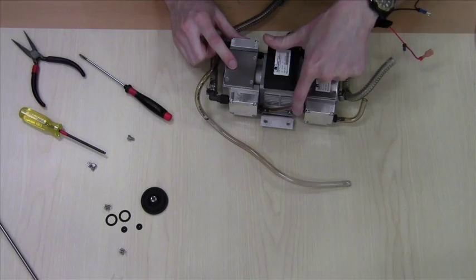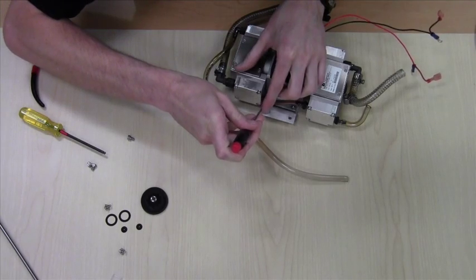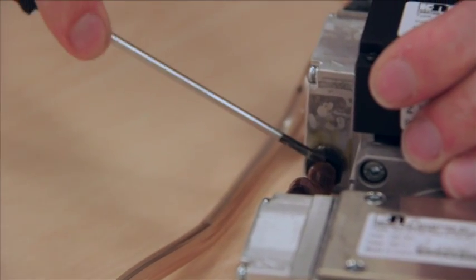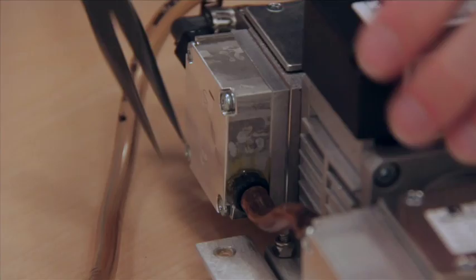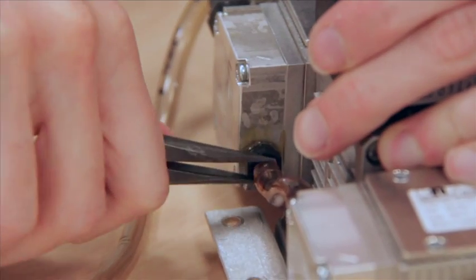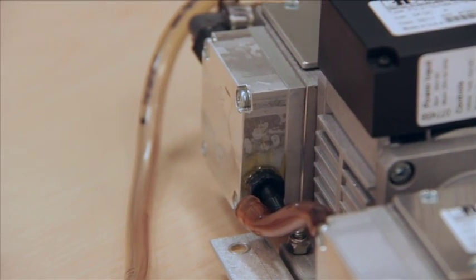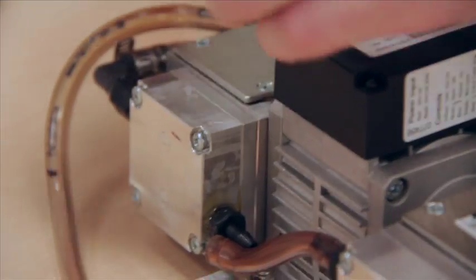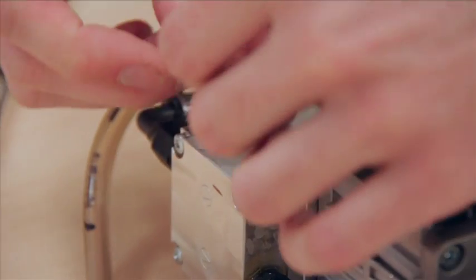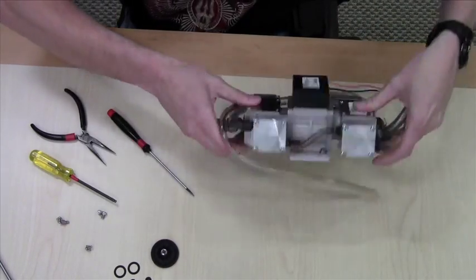First you'll want to remove either end of this connecting tube here. Next, before removing the block, there are two seams here. You'll want to tape the two outer ones together on the top and the bottom to prevent the block from separating when you remove it.